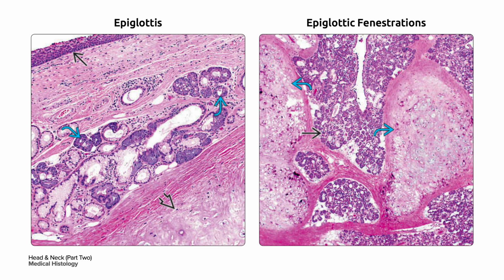On your right is the epiglottis, which is an elastic cartilage in curved blue arrow and has fenestrations in single black arrow, which usually contain seromucous glands and may serve as a conduit for carcinomas to enter the preepiglottic spaces.